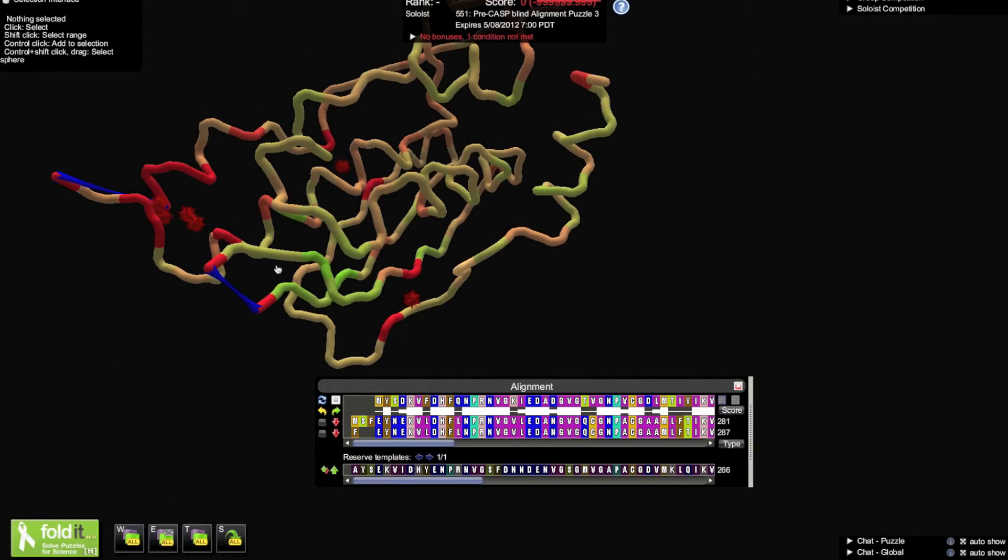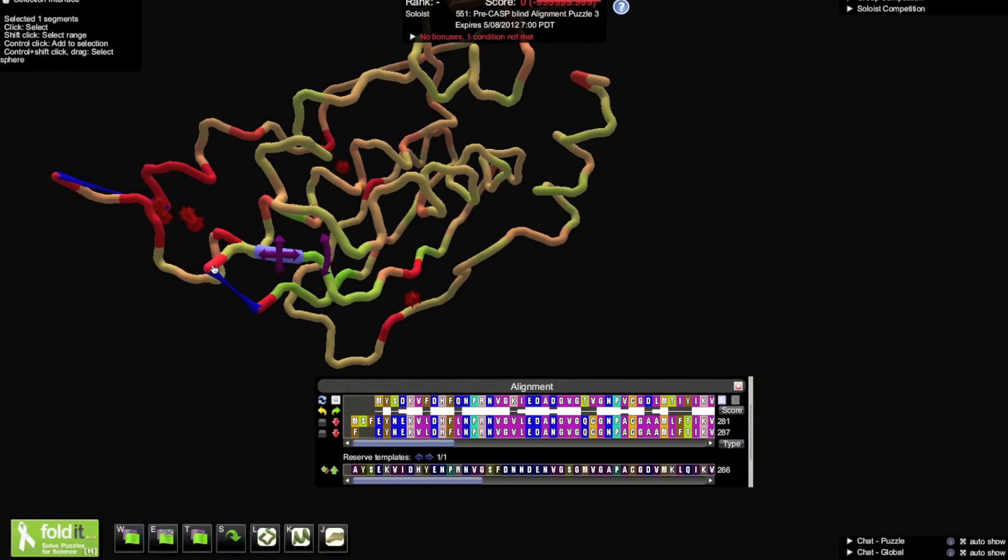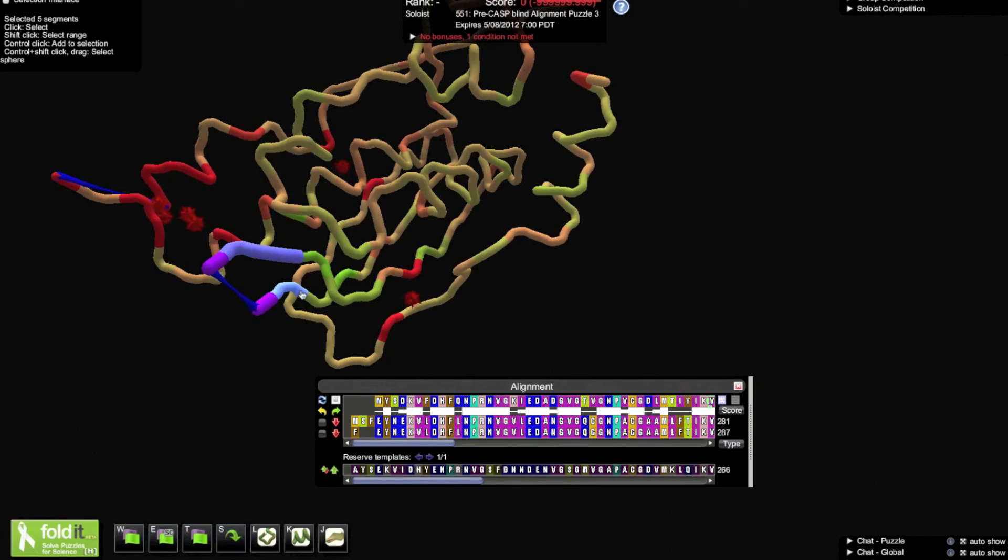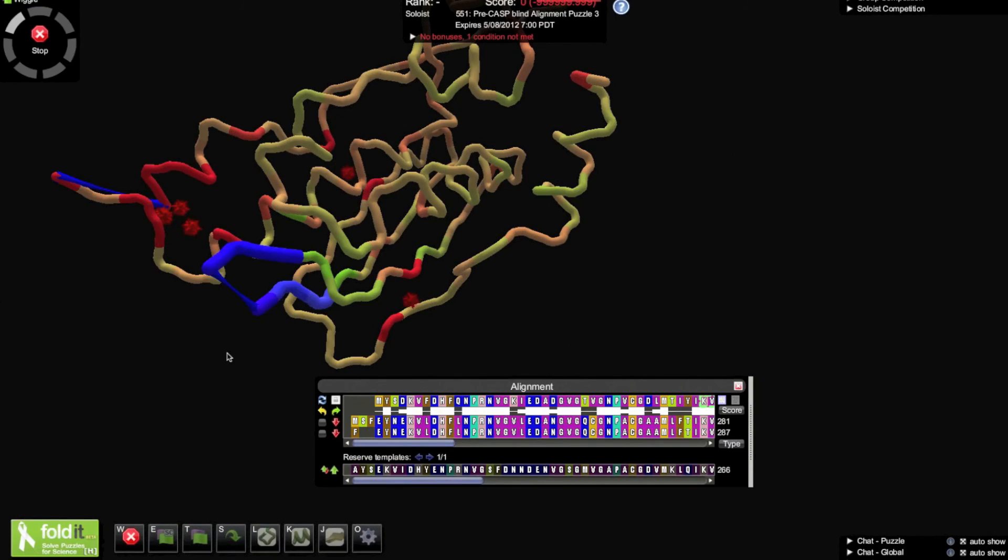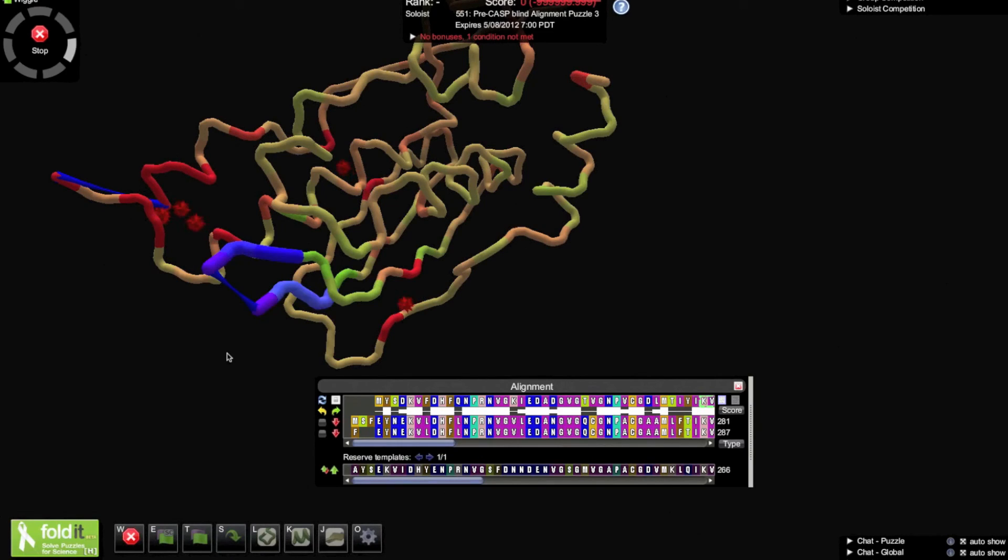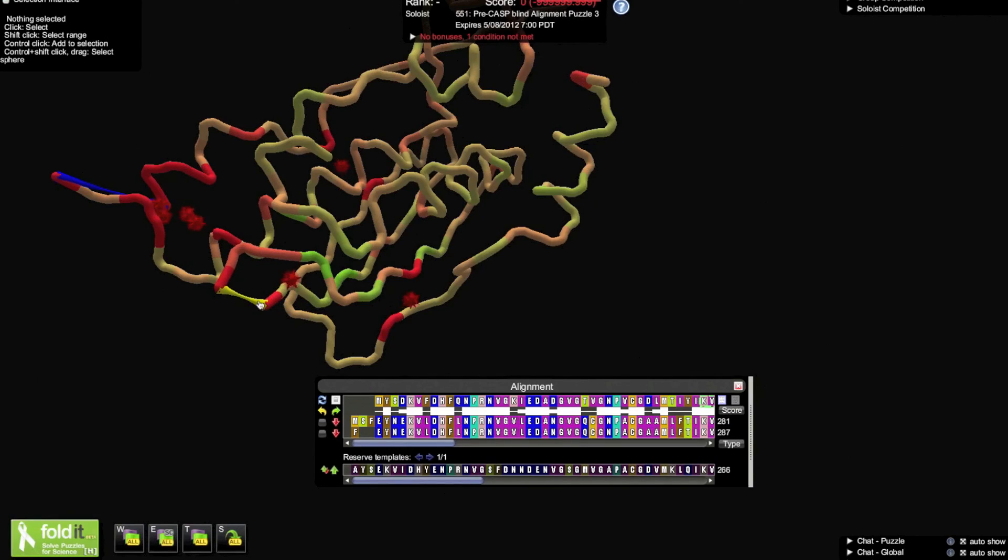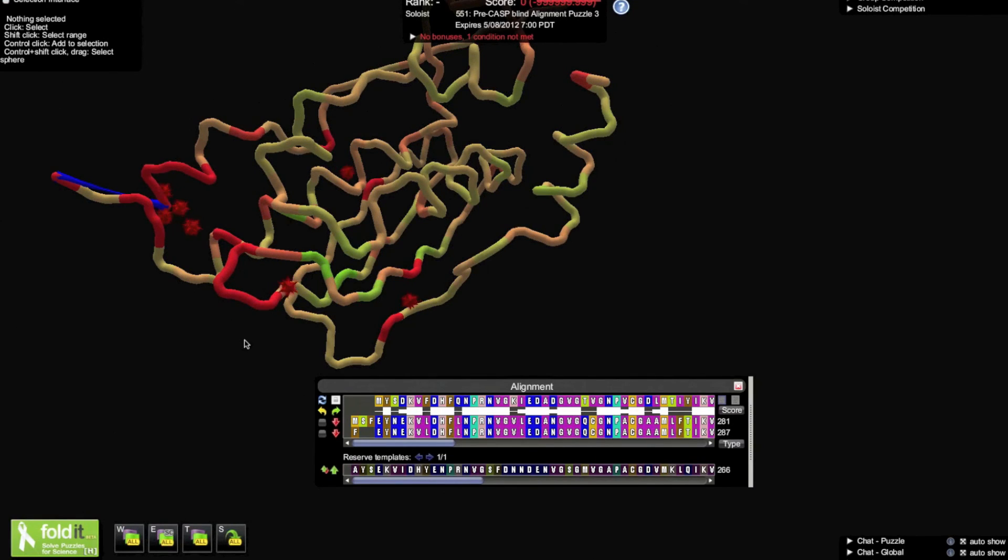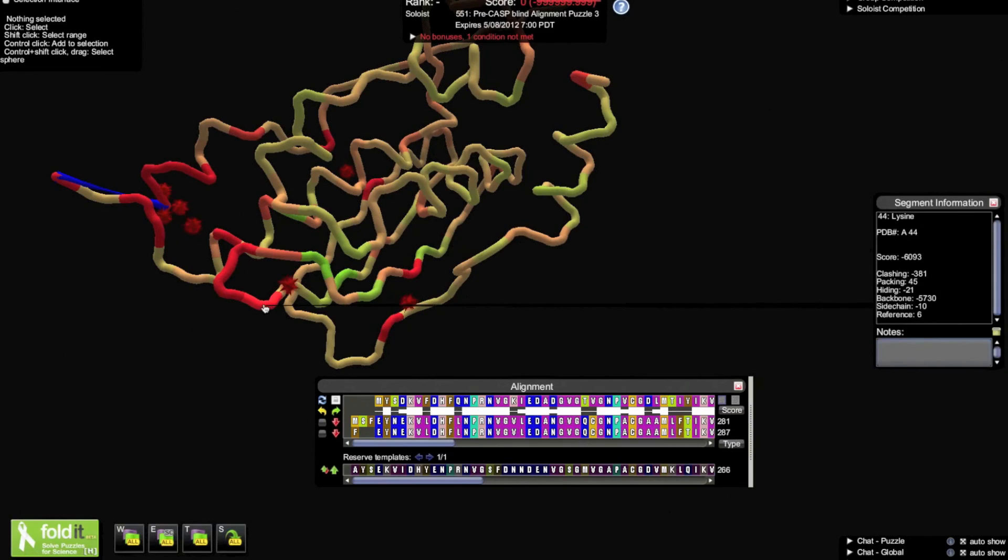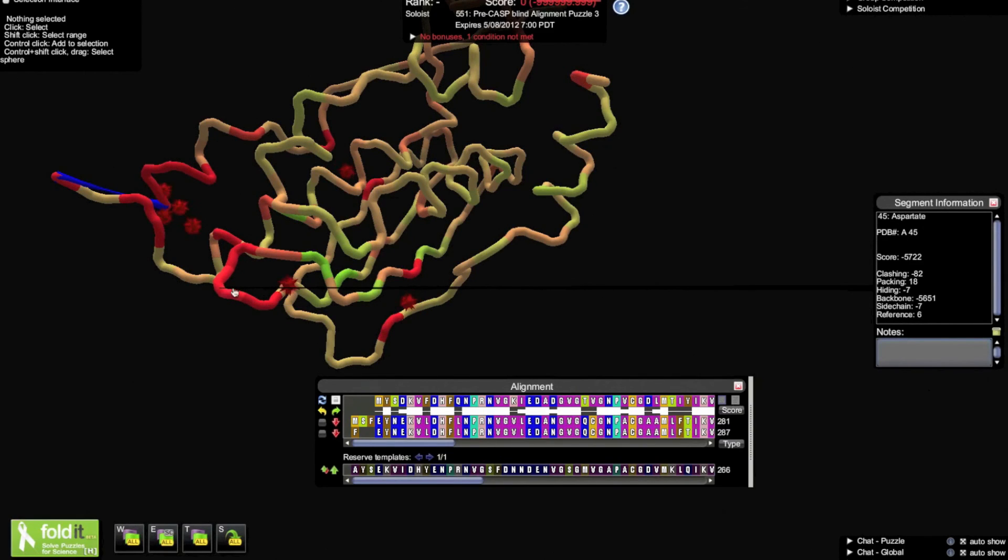Wiggle, pull, and rebuild to try to get the ends of the backbone the right distance from each other to close. When they are the correct distance, the band will change color, and by clicking it, the gap will be closed. Even when closed, more wiggling, pulling, and rebuilding will probably be necessary to improve score. On a technical note, closing gaps is difficult for automated methods. It is another opportunity for human intuition to do what computers cannot.